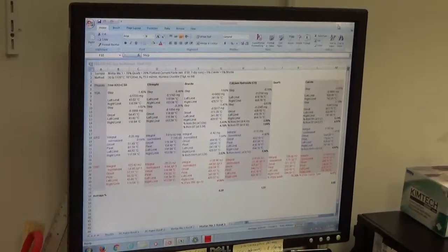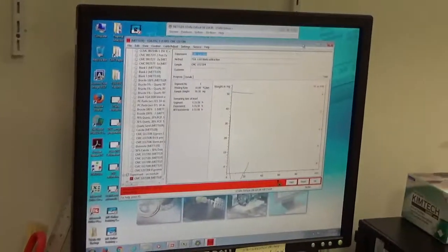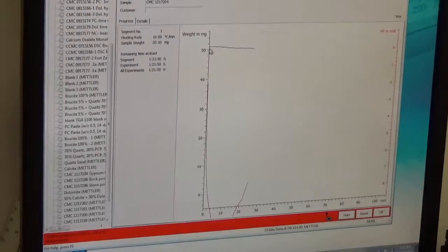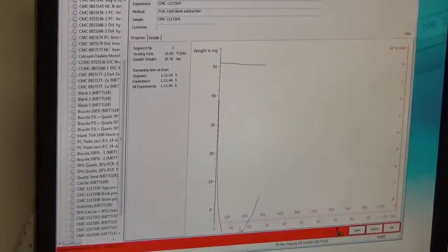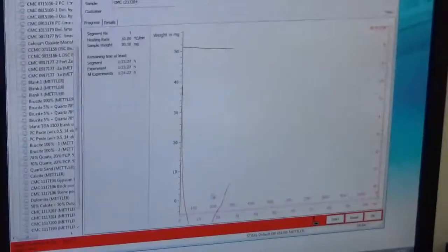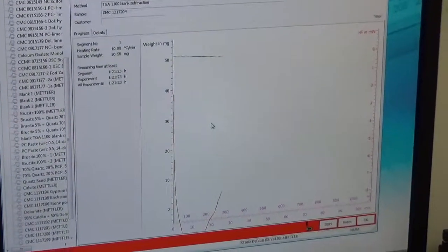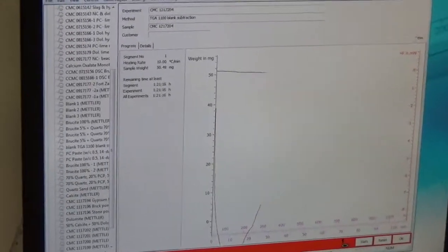Going back to the actual run I was doing — there is the run. You can see how the data is forming; there is not much change yet. If I double-click, it shows the temperature axis as well as the time in minutes. You can see it has already heated up to around 300 degrees, which you can also see in the touch screen showing 282 degrees so far. Nothing happened much except a big bump from a phase transition in the DSC curve, but not much drop in the TGA. This will run for 90 minutes and then provide the data.